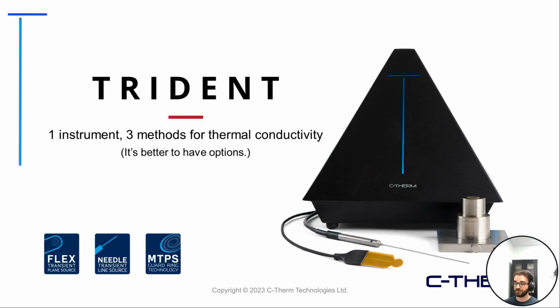And basically for the format here, I'm going to be going method by method and giving some information on the sensor itself, some of the criteria that need to be met to use the method on the samples, but then also go into some example highlights, some case examples and collected data, just giving you an idea of how these sensors can be set up and used.